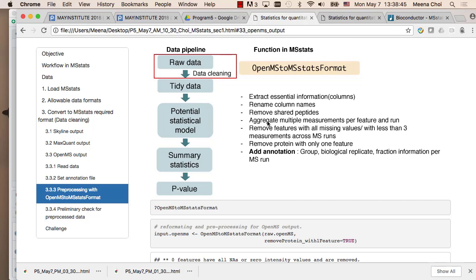Otherwise, for a specific feature in a specific run, they report a different measurement in multiple rows. Then we have to know why they have different values. It can be a different m/z value, or maybe something else. In that case, if the processing tool considers this and reports the correct format, it is perfectly good. That is what we expect. But we actually look at many different cases, and there's no best or correct way.